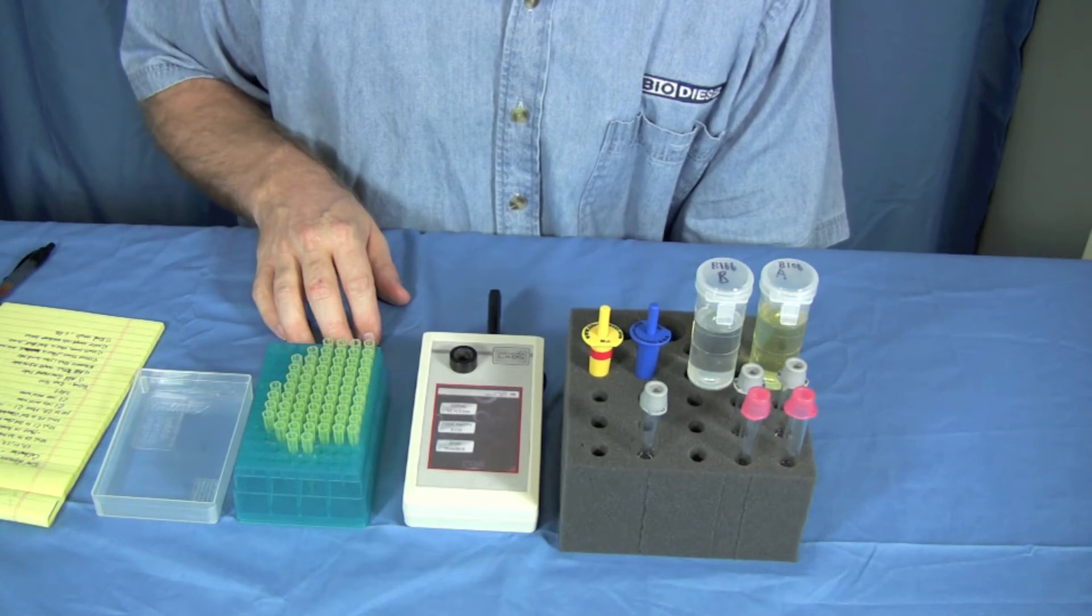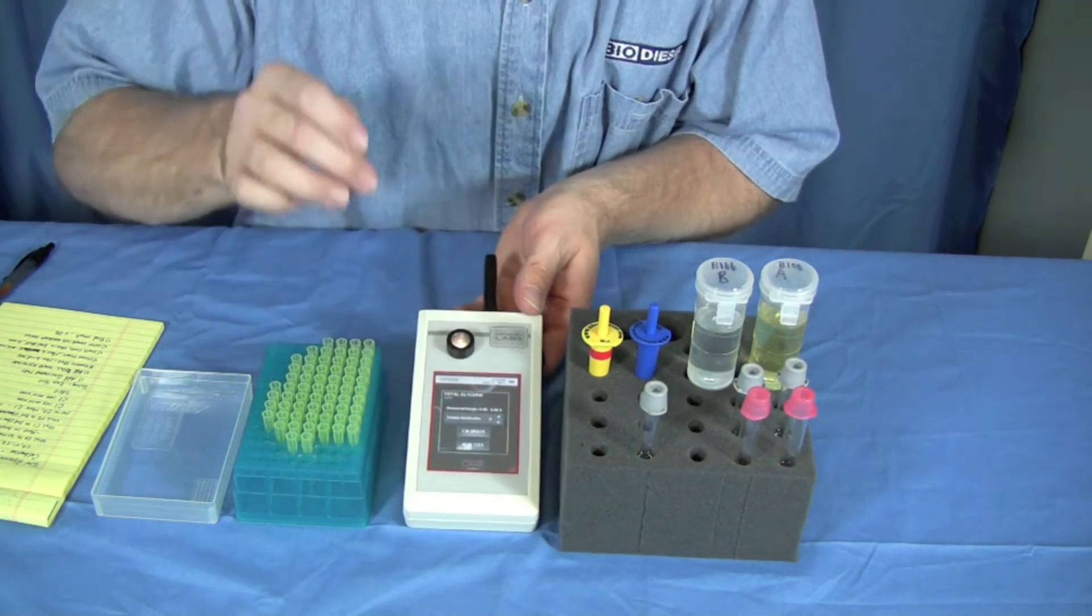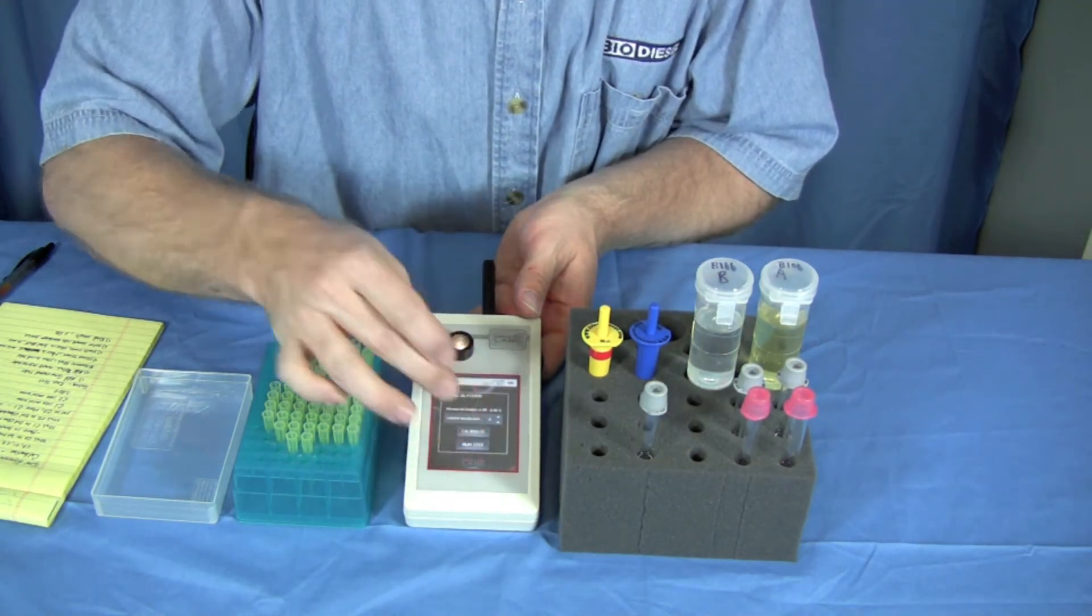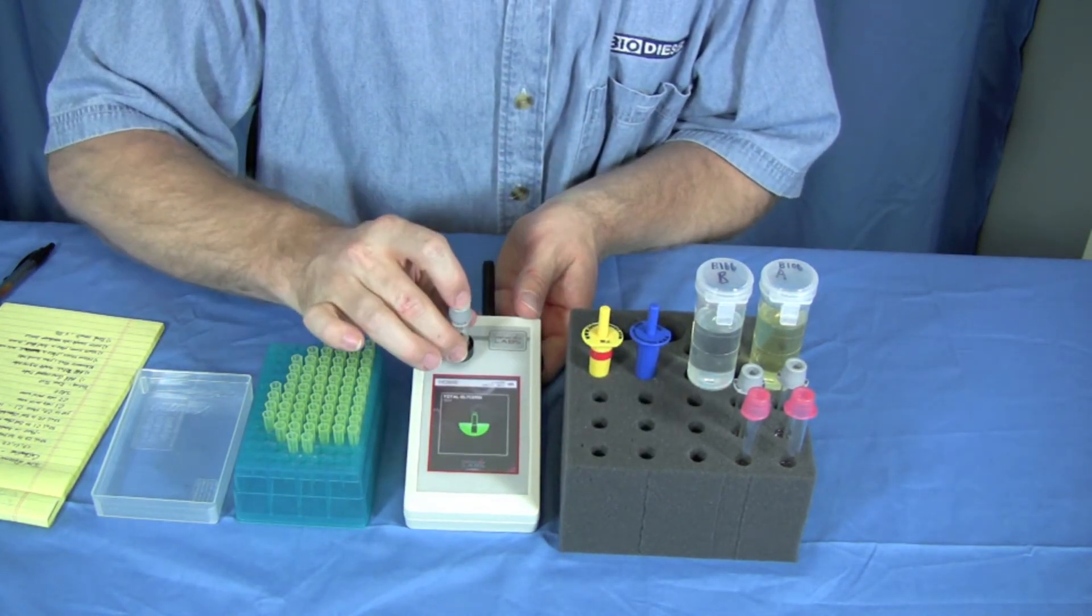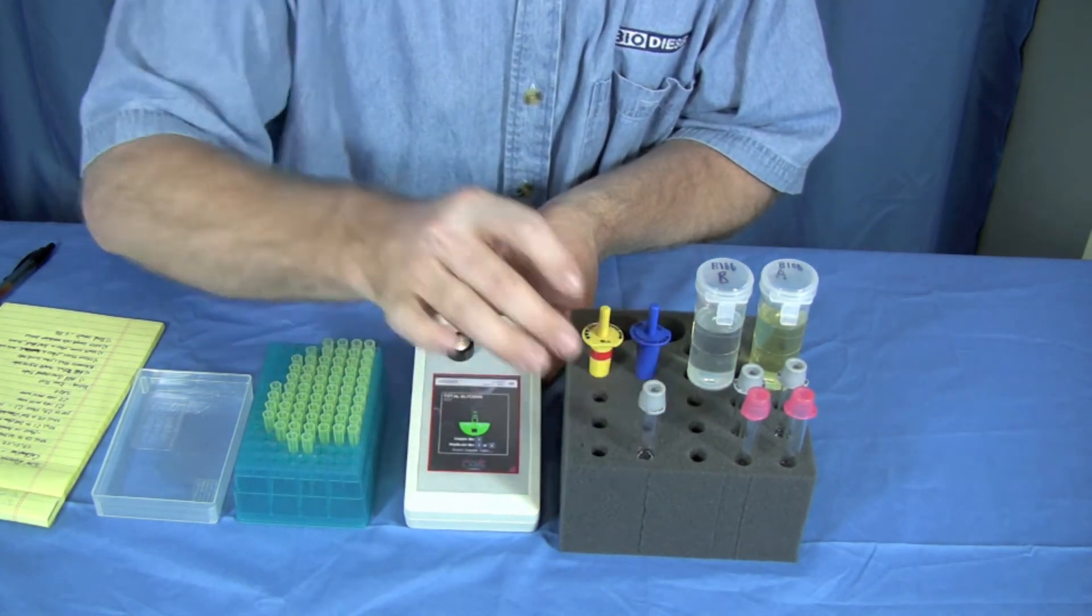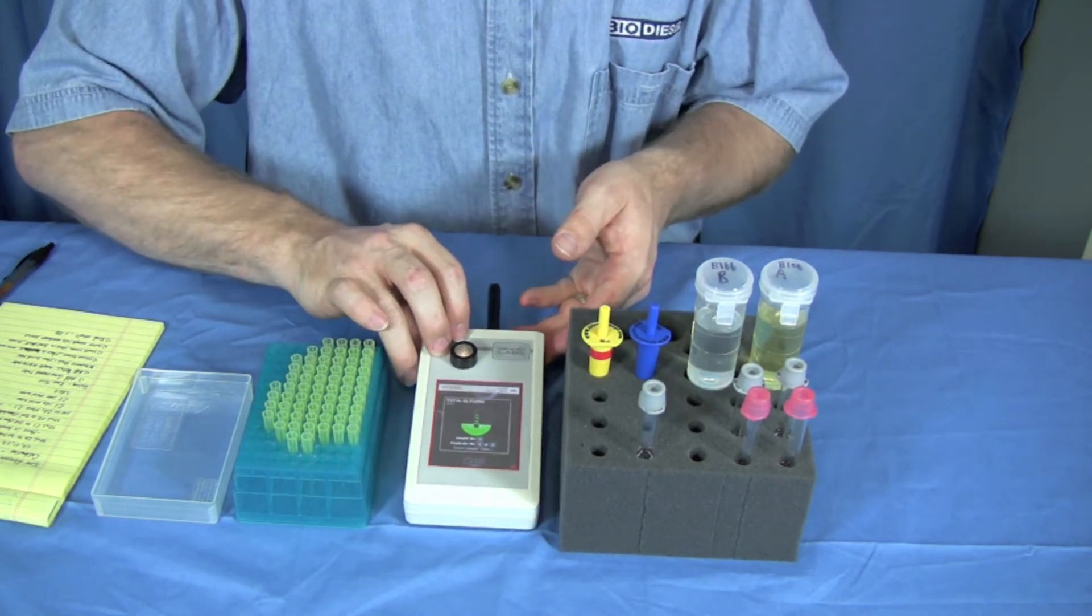We're going to perform a total glycerin test. To start the test, you just choose total glycerin test and run the test. We're going to take a blank tube, put it in, pull it out. Now it's time to prepare our samples.